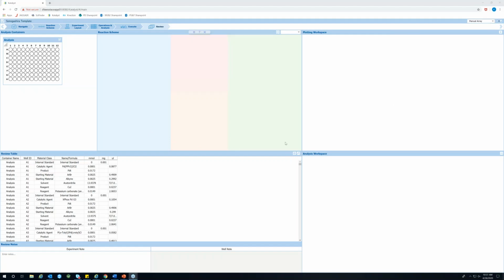Right, thank you, Kevin. And wow, it's always good to see the software application running in a customer environment. And I always hold my breath a little bit of like, okay, is everything going to work? And oh, wonderful. So thank you for the demonstration. And I believe it truly represents facilitating high throughput experimentation and almost a democratic accessibility aspect. So that was really helpful for me personally, and I hope for the rest of the attendees of the webinar.